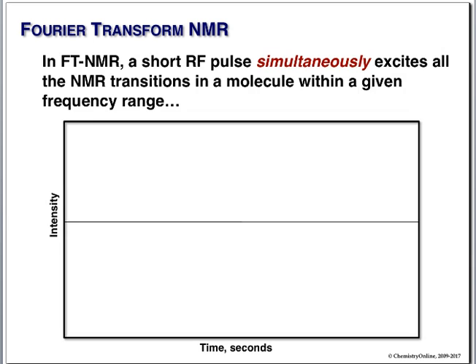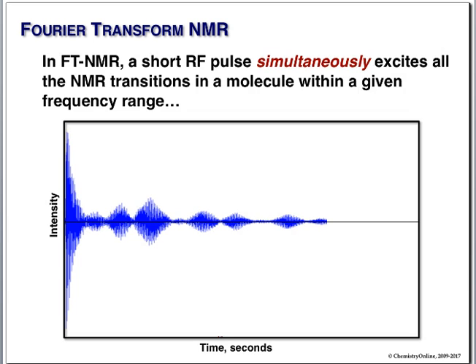We're going to pulse it, and we get a unique pattern depending upon how many hydrogens there are, where they are, what the coupling is, etc., etc. Now, you do this pulsing thousands of times. Your computer memorizes the pattern every time. You do noise averaging, and then you do the mathematical operation called Fourier transform, and by George, you wind up with a spectrum.